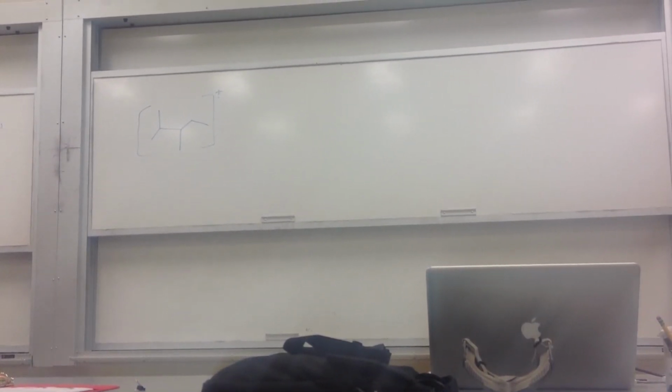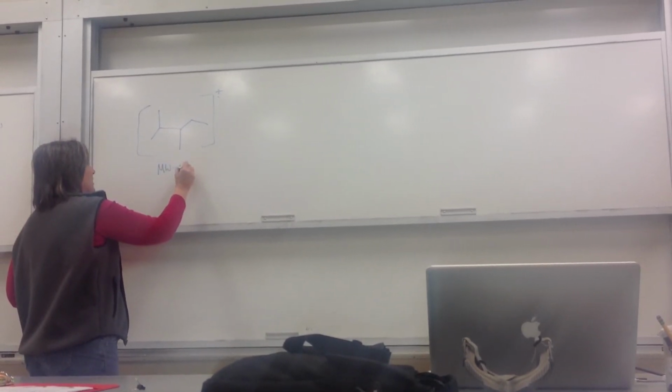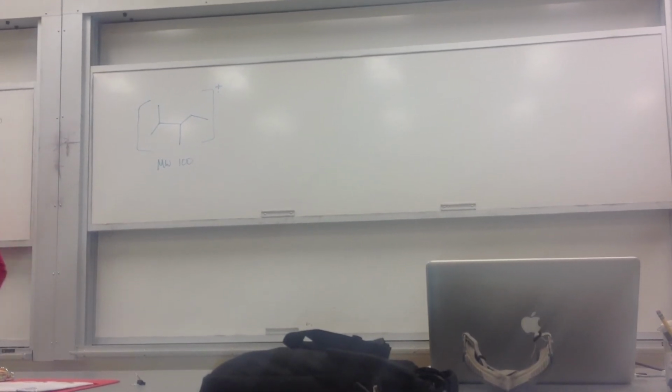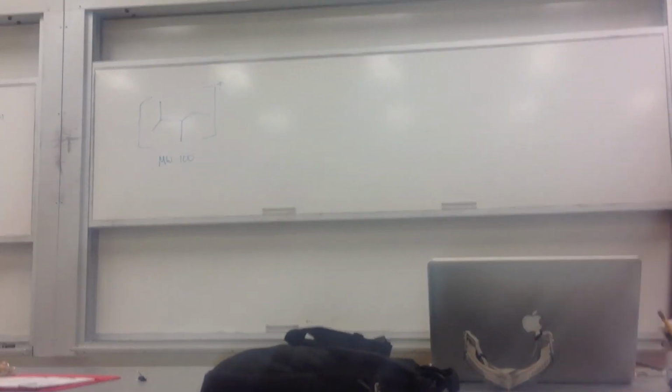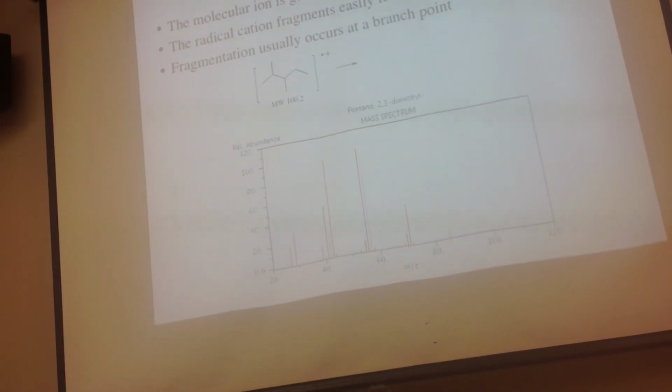Okay, so the first thing has a molecular weight of about 100. Do we see a peak at about 100? Yeah, it's tiny, but it's there. Super tiny. Okay? But right there is the molecular ion peak at 100. So we do see that.